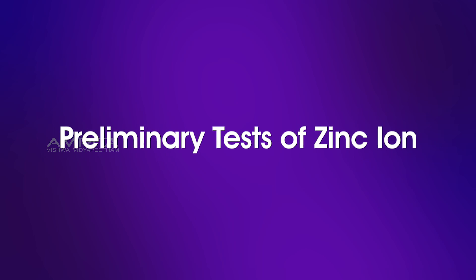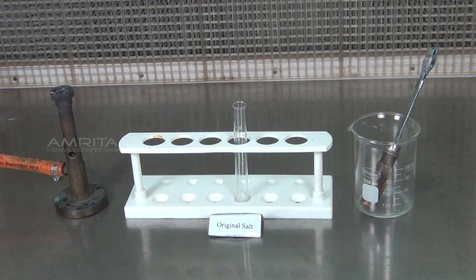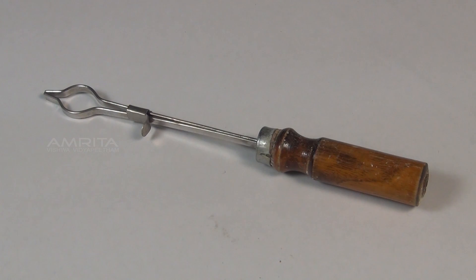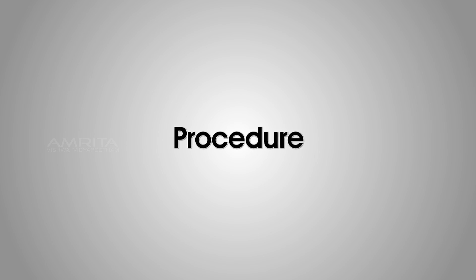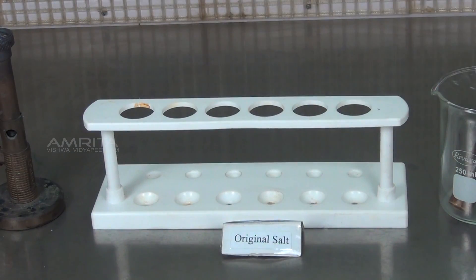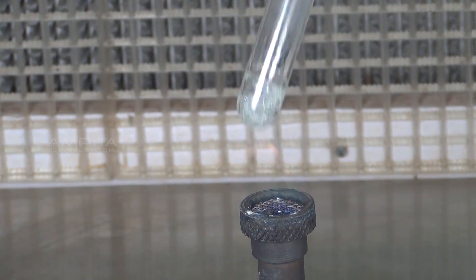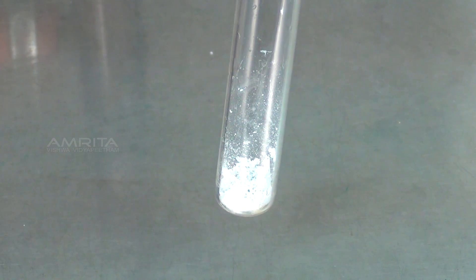We look at the preliminary tests of zinc ion. Dry heating test. Materials required: original salt in a test tube, test tube holder, and Bunsen burner. Procedure: Take a small quantity of salt in a test tube and heat it over the Bunsen burner. The salt becomes yellow when hot and white when cold, indicating the presence of zinc ion.